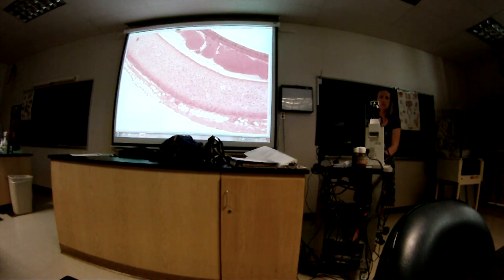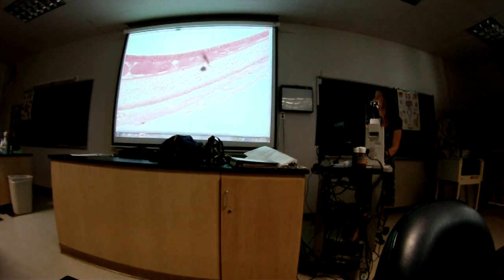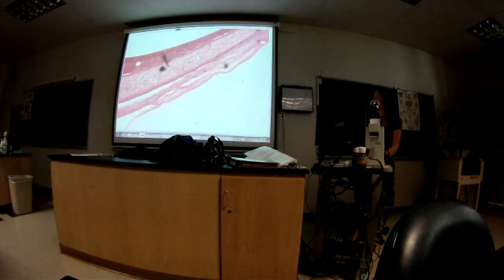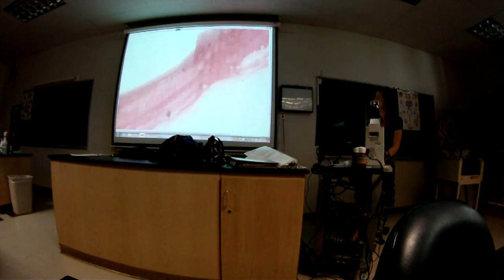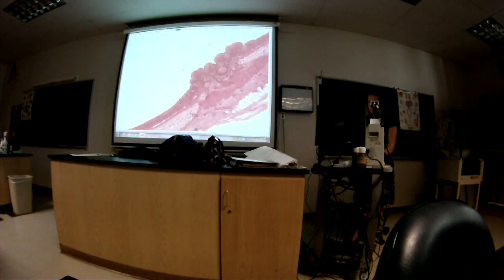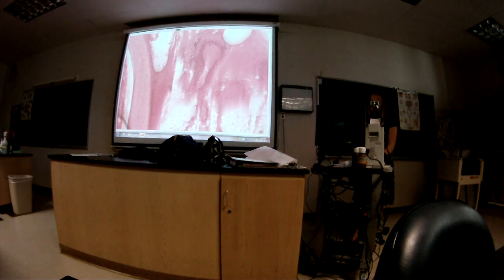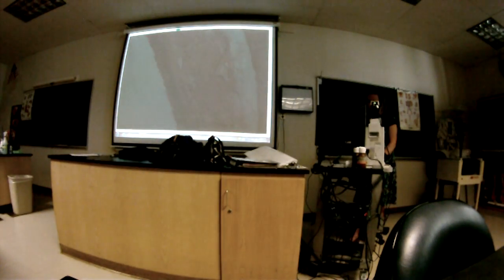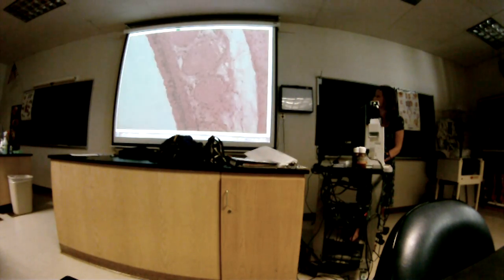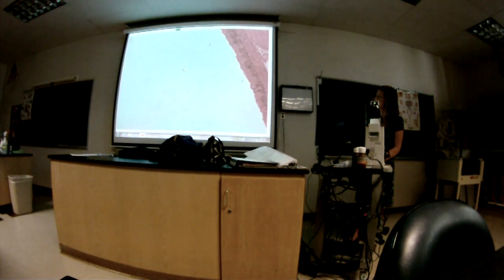So the question is going to be, what's this organ? Have a look at this. All right, get a little closer, if you can.